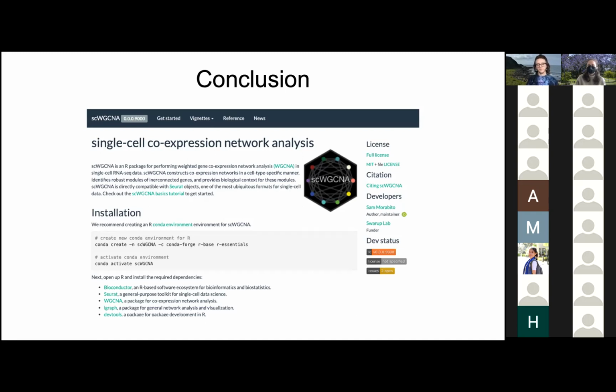What if your module is only influenced by a batch effect, or by high mitochondrial gene expression? That will identify which ones are modules you don't really care about anymore, because they're driven by the technical variance.